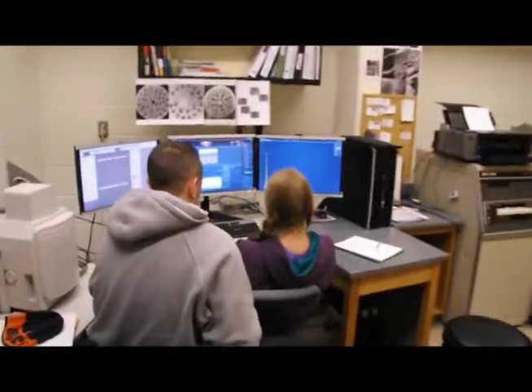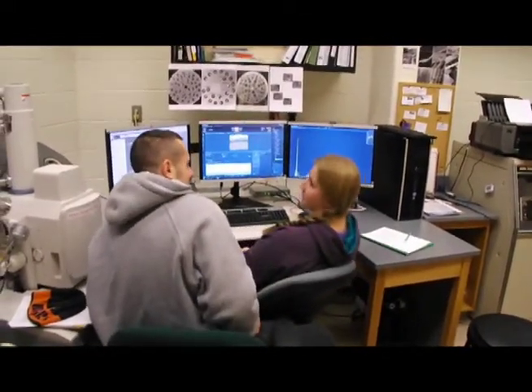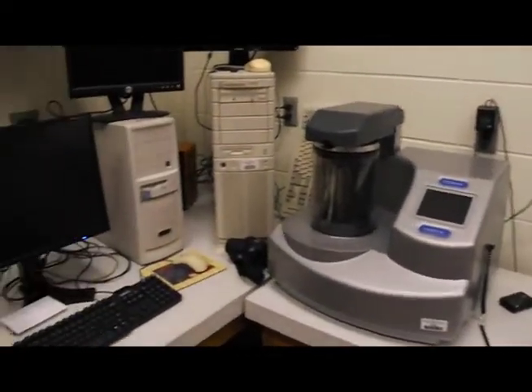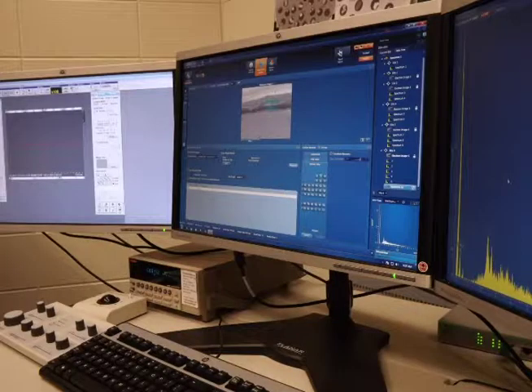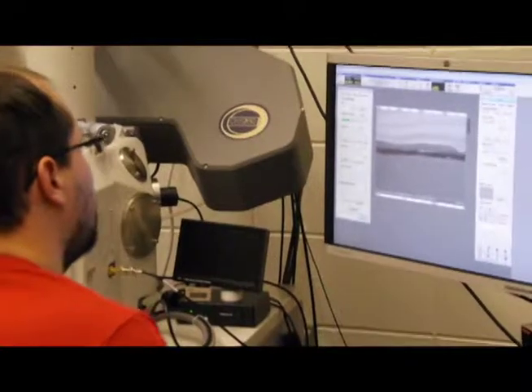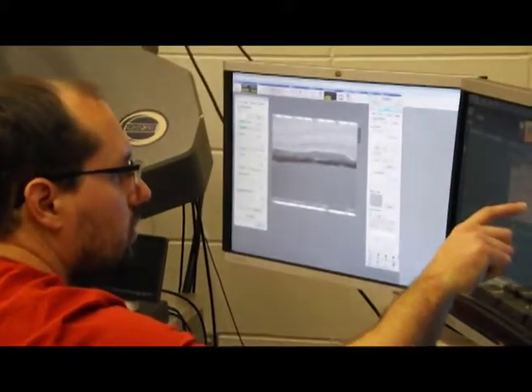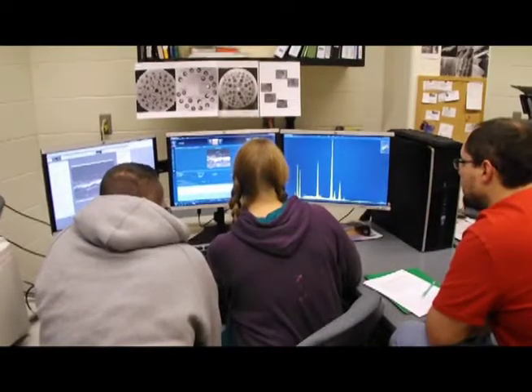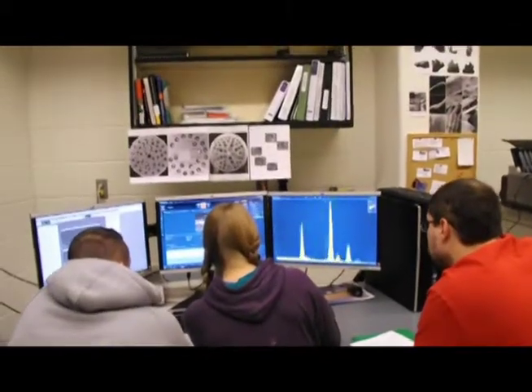We then turn on the electron beam, and that is how we image the specimen. So it sits there, and then you have this electron beam that is continually bombarding the specimen with electrons, and those are bouncing off. And what we get is what's called a backscatter electron image. So those are all the electrons that shoot into the specimen, and when our beam hits the specimen, it's going to knock out electrons off of that sample, and so those are what bounce back, and then we catch those in a backscatter electron detector, and that's how we image the sample.